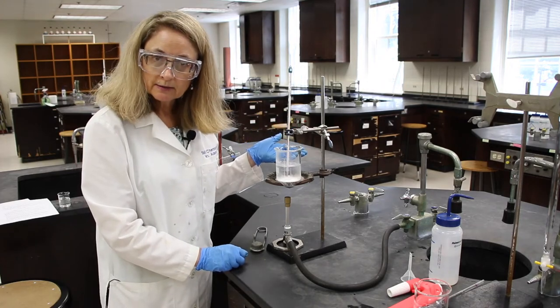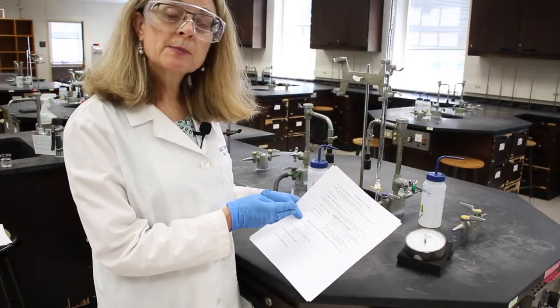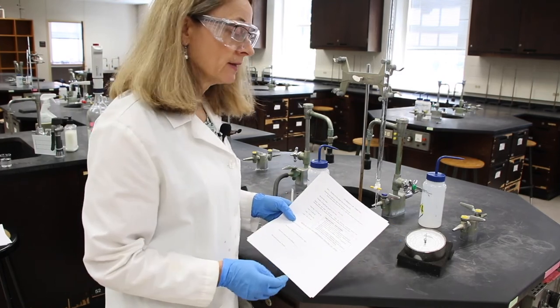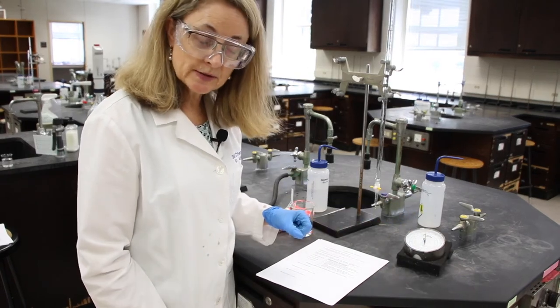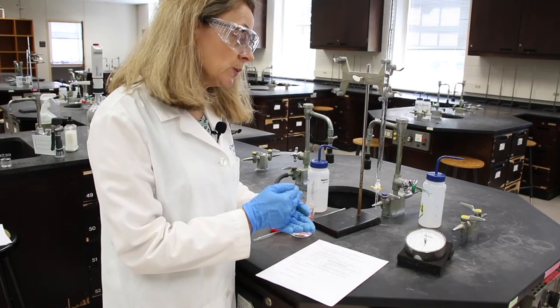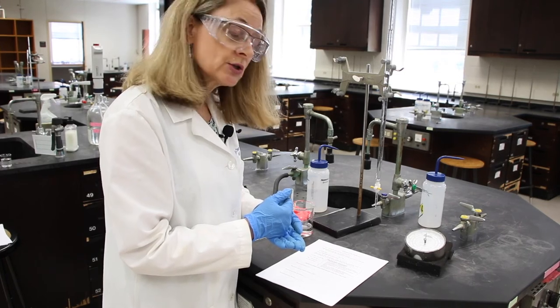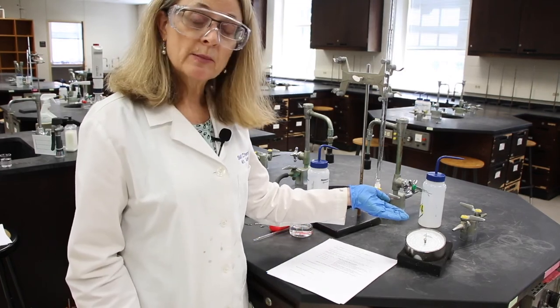Let's do Part 3 while we're waiting for the water to boil. We are going to read and record the barometer, which records the pressure in the lab. We're going to be reading the middle red scale, which is in millimeters of mercury. The smallest divisions are one millimeter of mercury, so we'll read to the one millimeter and then estimate to the tenth — your final barometer reading should have four significant figures. Why don't you read the barometer for us?